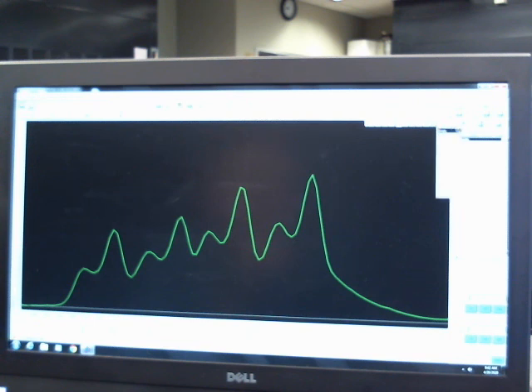So I'm going to go to measure, horizontal, here to here: 2.12 hertz. Then from here to here is 4.94 hertz. Okay, so now we have the J values experimentally for the actual product that formed.